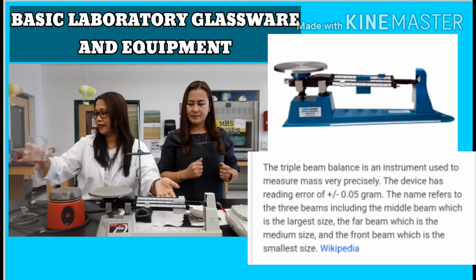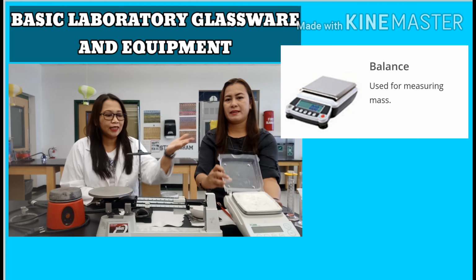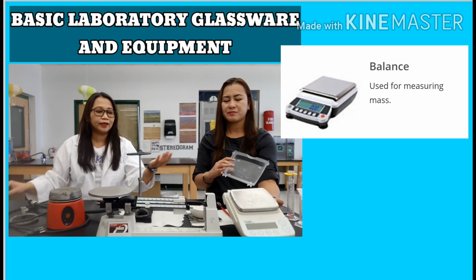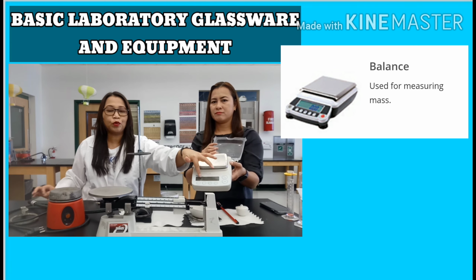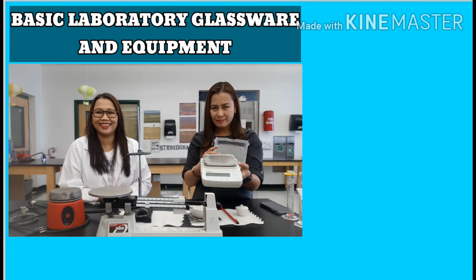Yes, right. And then last we have the digital balance. So this is easier to use than the triple beam balance because once you put something on it, it will digitally give you whatever is the mass or the weight of that substance.